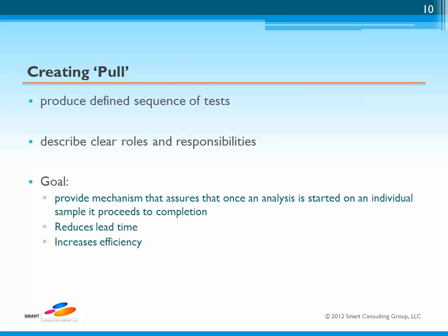Let's talk about creating pull. Make value flow and create pull in the system. The way forward is to produce a defined sequence of tests and to describe clear roles and responsibilities for the analysts and any support personnel involved.